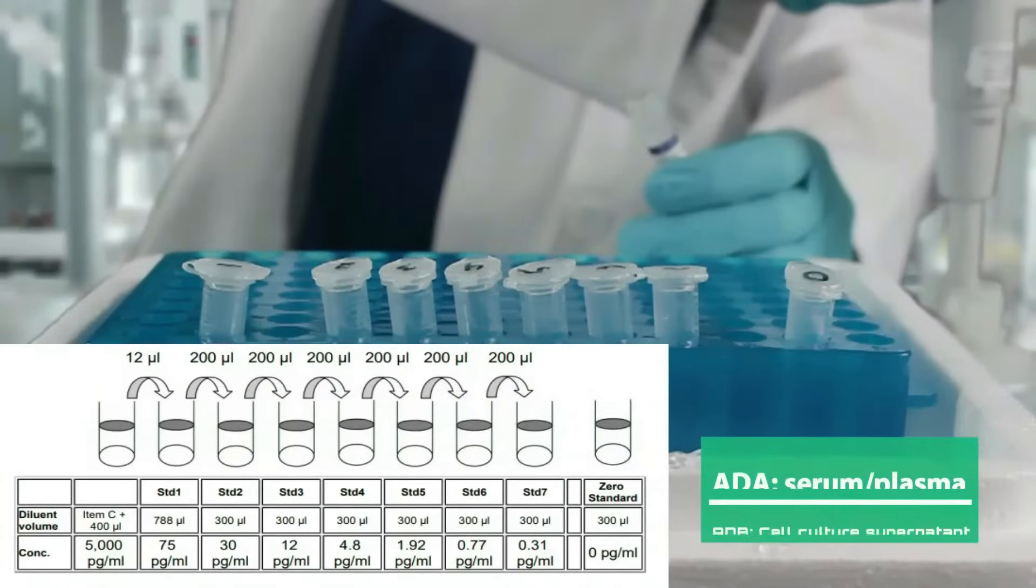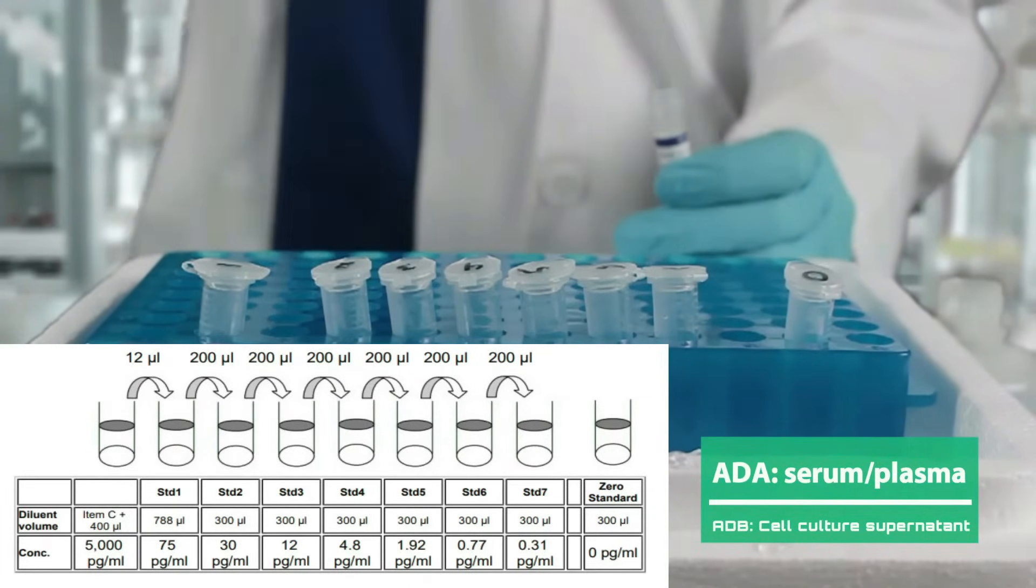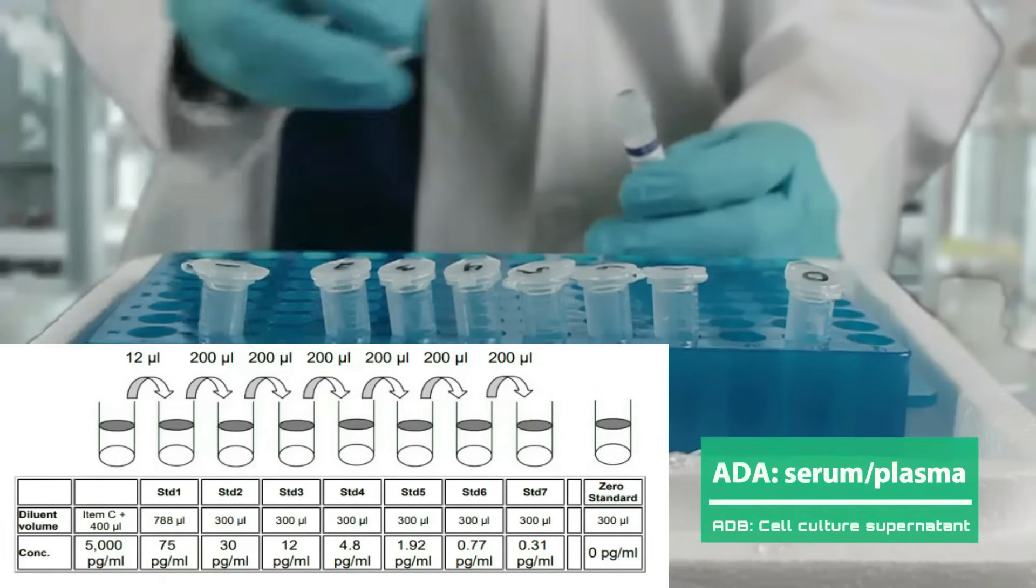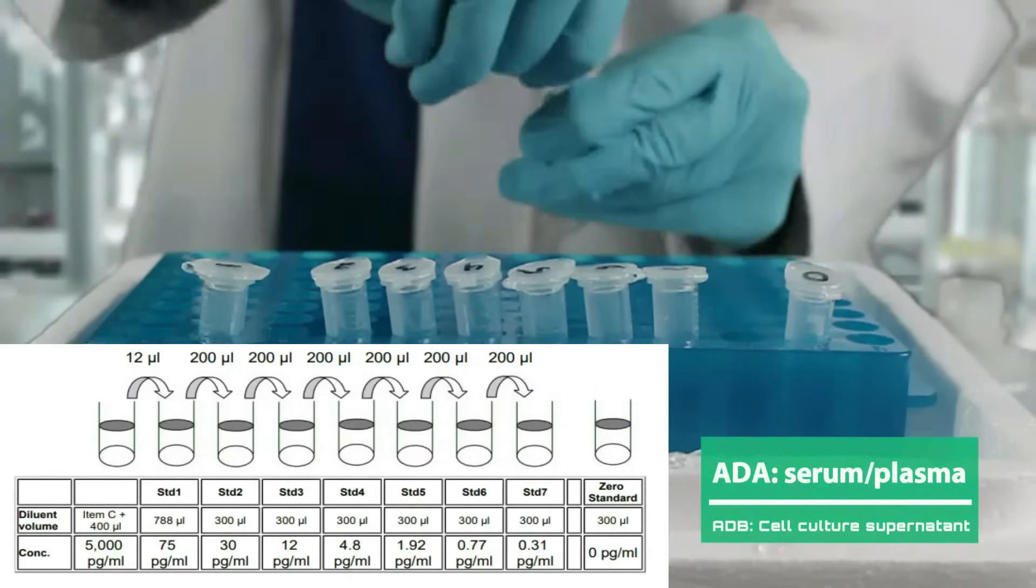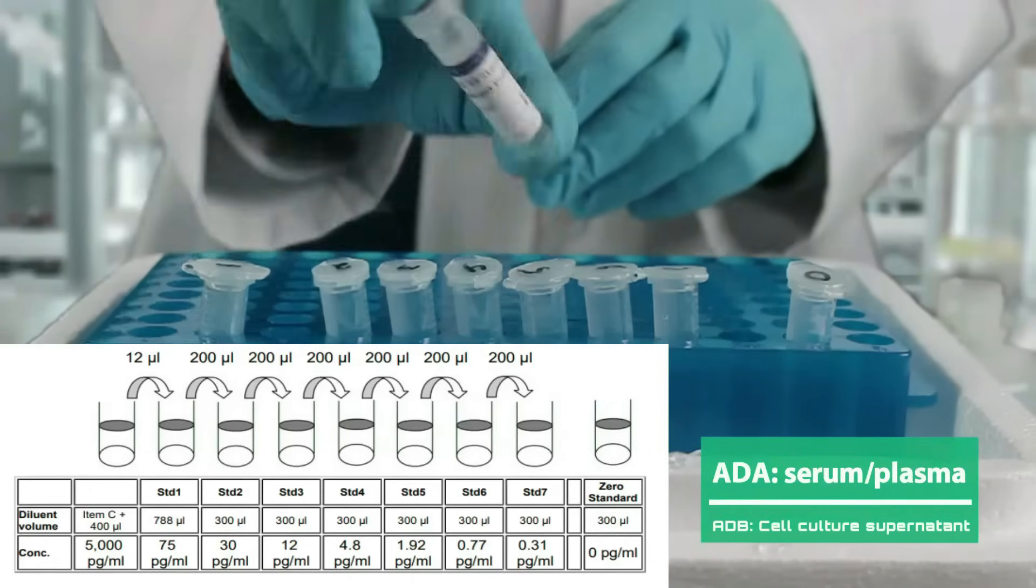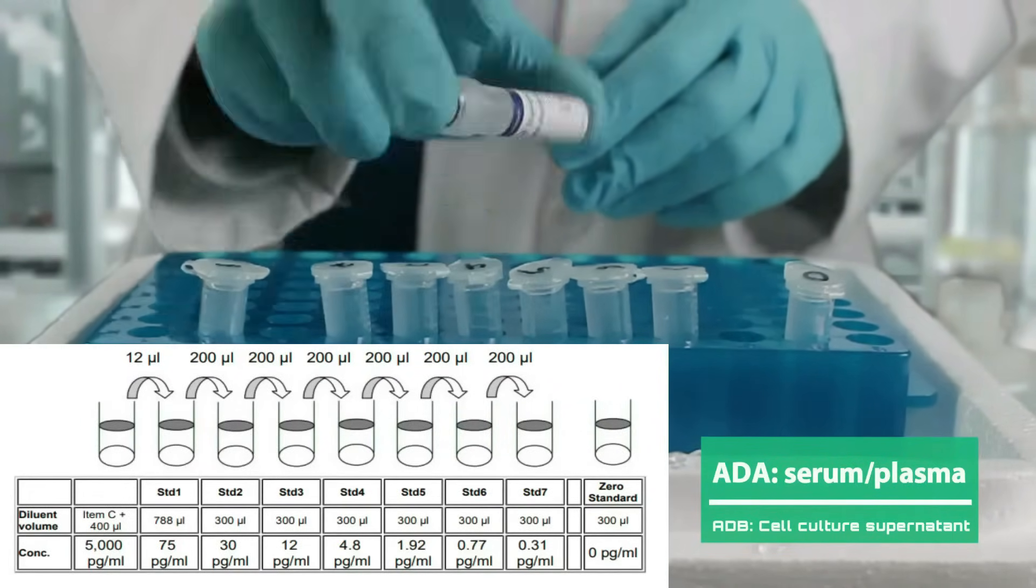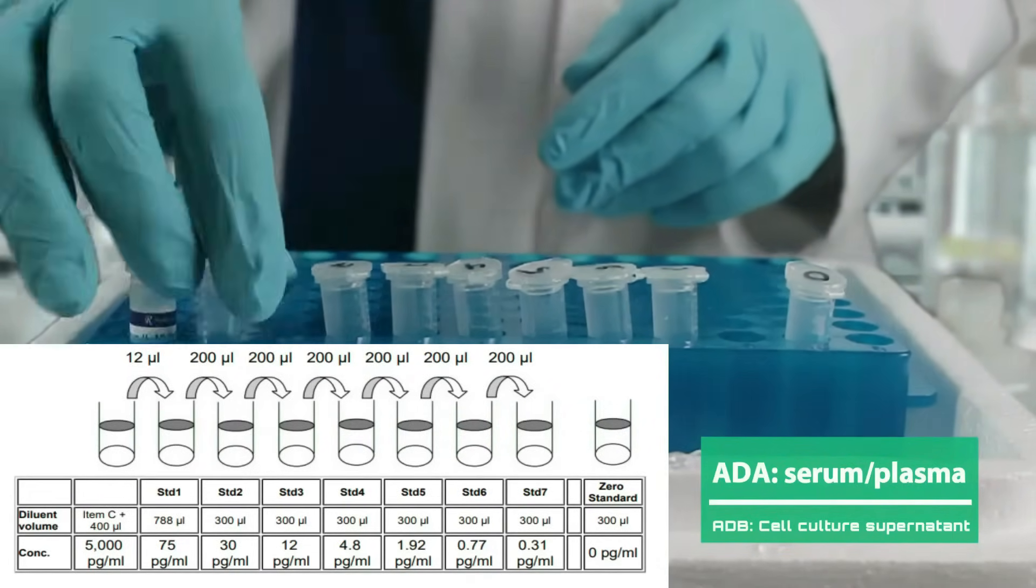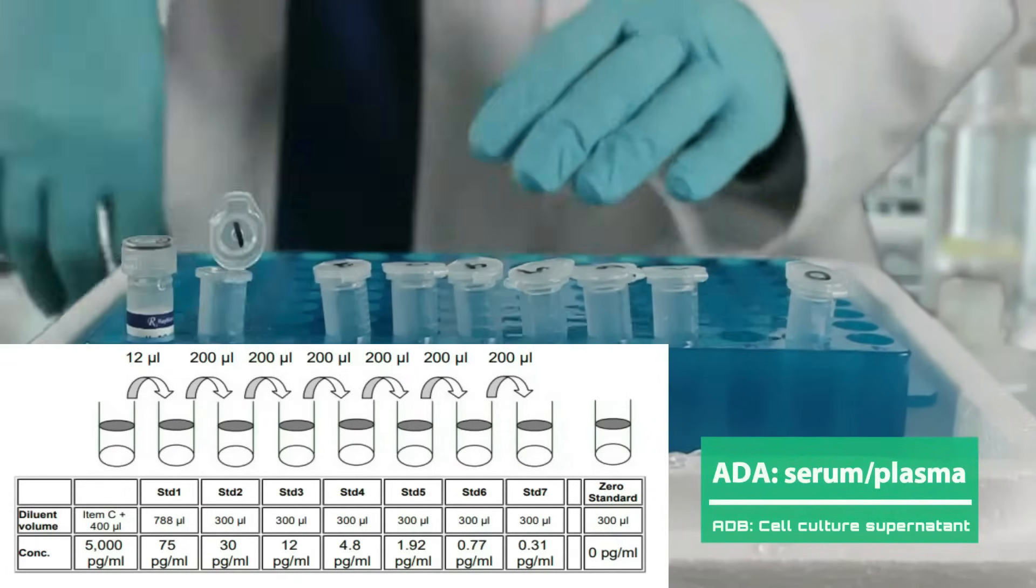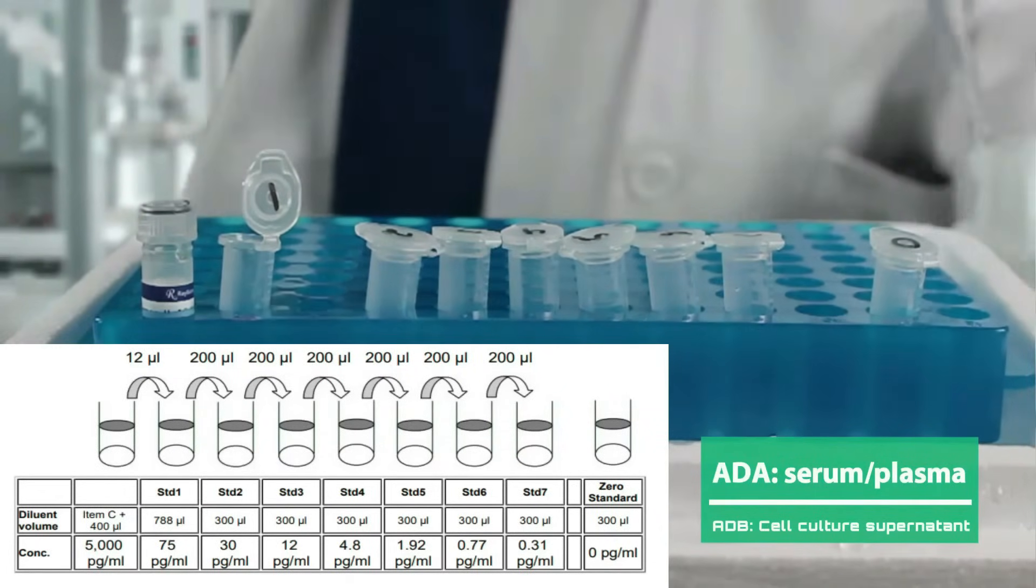Our samples for this demonstration are serum and plasma, so we are going to use ADA as a diluent. If your samples are cell culture, use ADB. Reconstitute the lyophilized mixture with 400 microliters and ensure it is thoroughly mixed in a homogeneous mixture. Next, prepare the tubes with the indicated volumes. For standard 1, add 788 microliters of ADA. In standards 2-7 and the control, add 300 microliters.